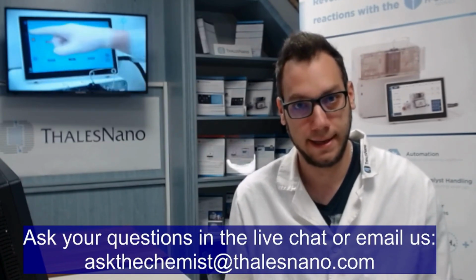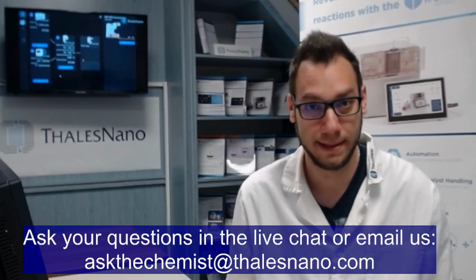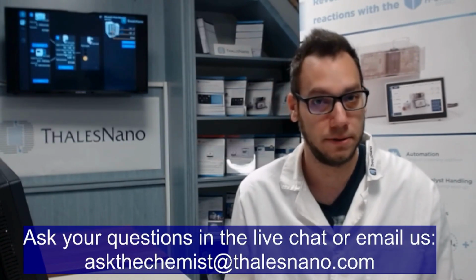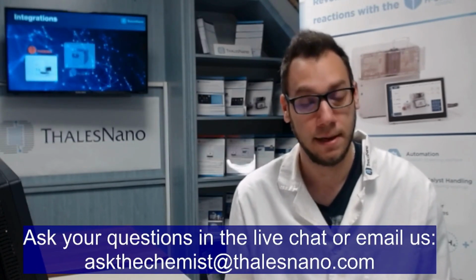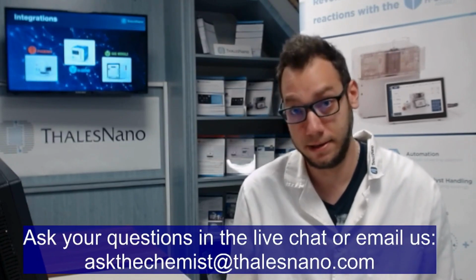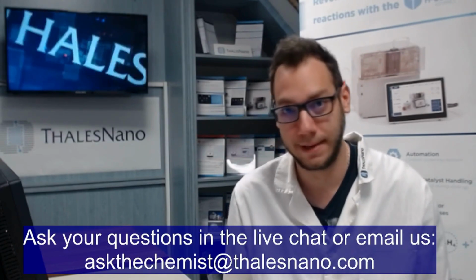You can run a clean solvent and a hydrogen mixture through the cartridge to reactivate its active sites, and you can do this a couple of times. Again, the number of times depends on the type of reaction, but it's a good trick to refresh the catalyst and reactivate its active sites. Of course, you cannot do this indefinitely, so eventually the catalyst activity will permanently run out. However, it's a generally good rule of thumb that 1 CatCart will be able to transform approximately a few grams to a few tens of grams of material.